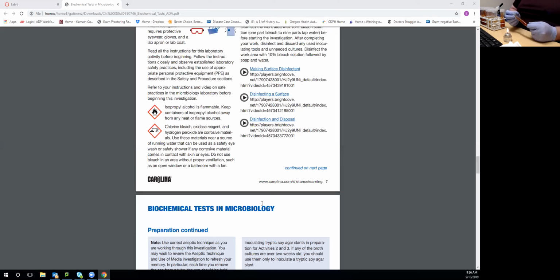Okay, why do we do what we just did? Well, you have a deep butt on the tube, and we need to study both the anaerobic traits and the aerobic traits. The anaerobic traits are studied by putting the organism inside the media where no oxygen arrives, and the aerobic traits are studied here.